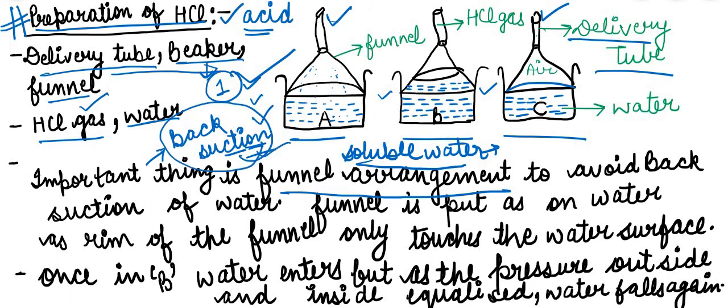So the funnel is put on the water. As such, only this rim of the funnel will touch the water molecules. Once the HCl gas starts traveling, a small amount of water gets up into the funnel.